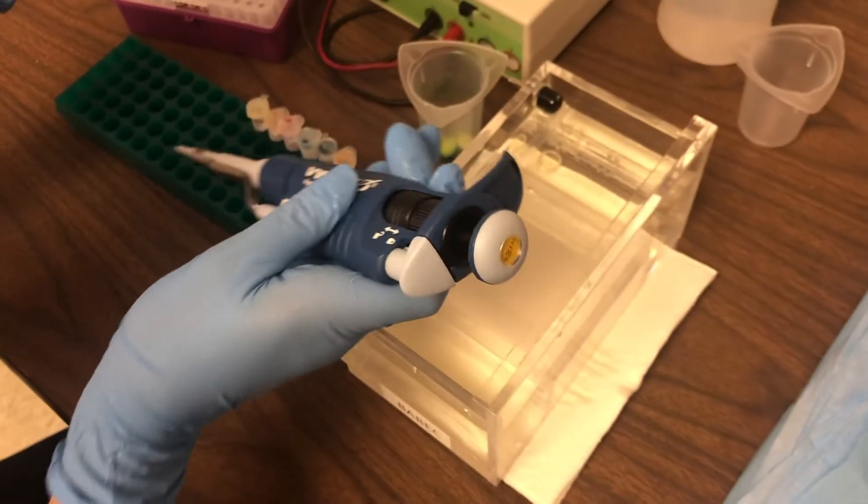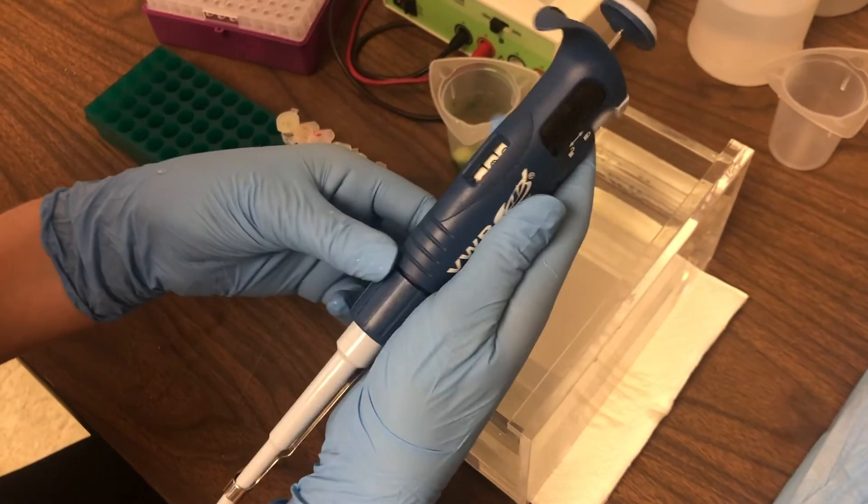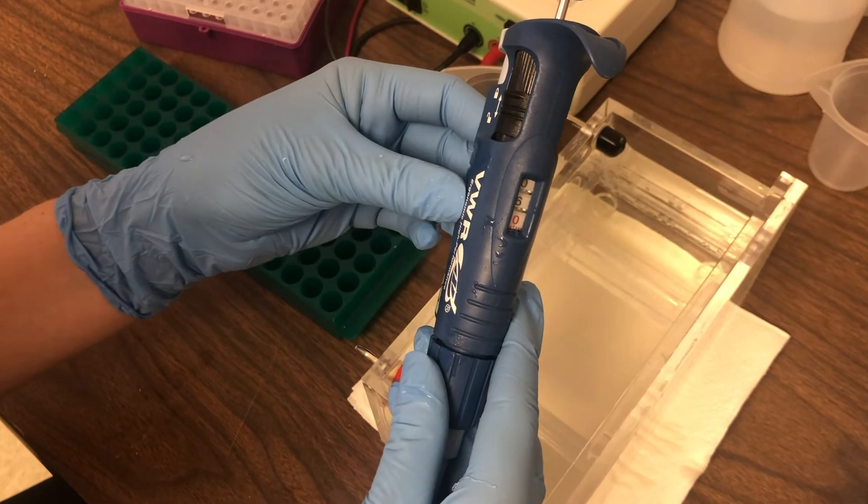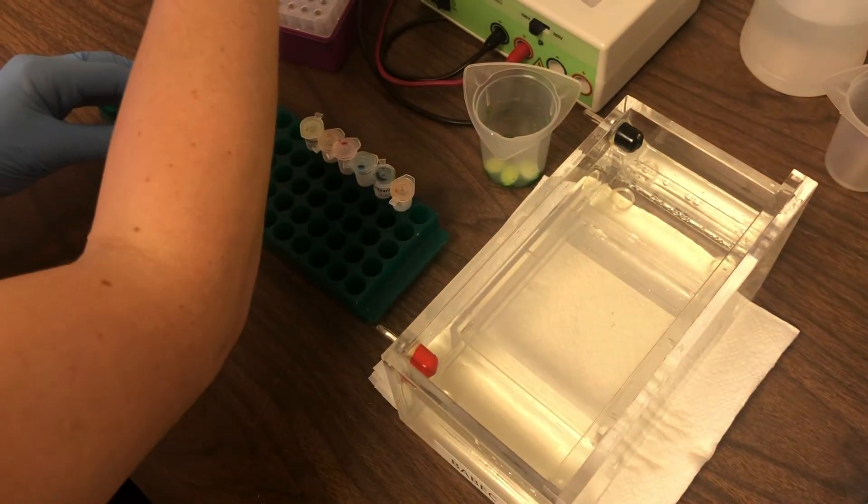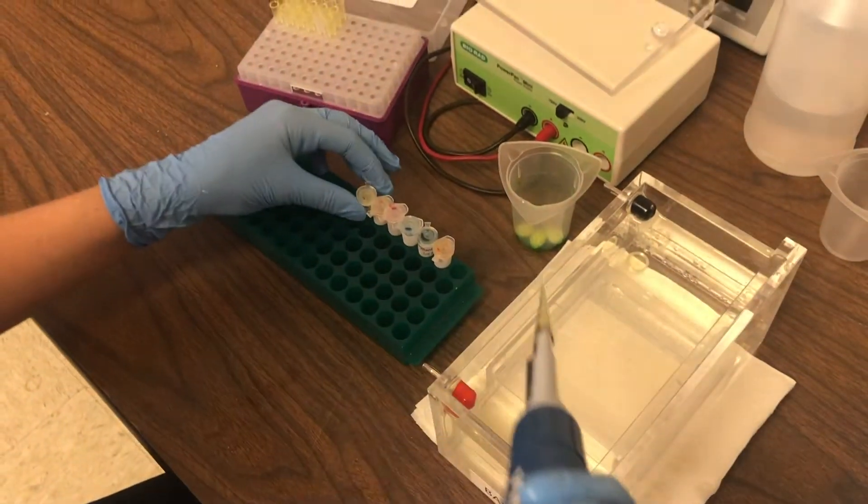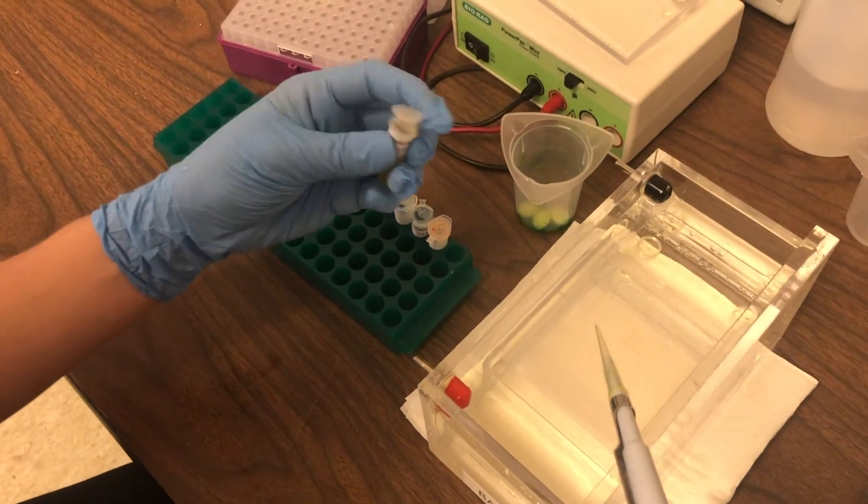Grab our P20 micropipette and set the volume to 6 microliters. Get a tip onto our micropipette and we are ready to load our samples.